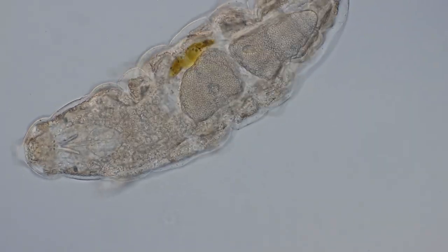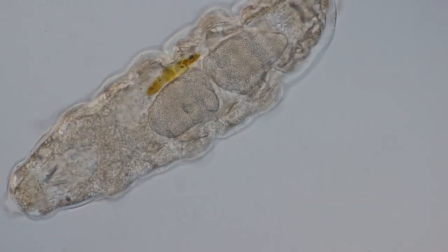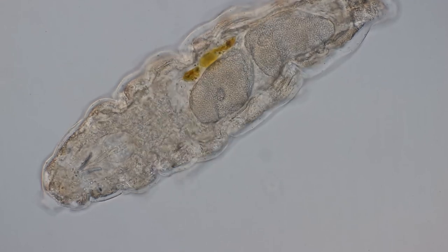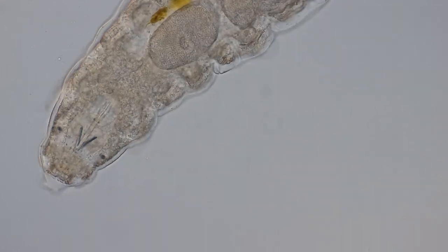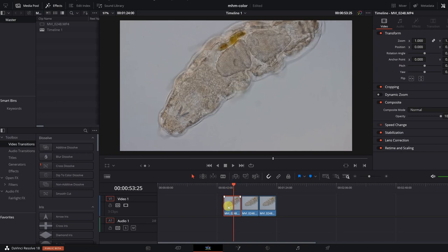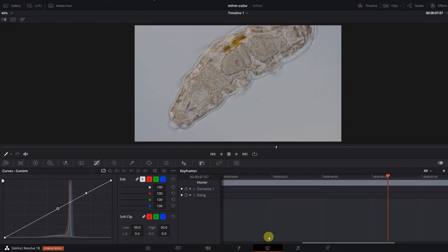So this here is the original footage, it's a tardigrade, and you can see that the contrast is not very high, so I think we have to improve on this a little bit. I started up the program DaVinci Resolve and I'm now switching into the color menu.